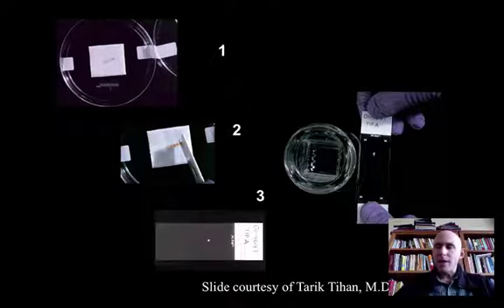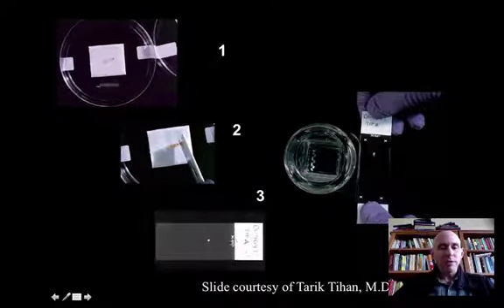You select the pieces that are not simply normal brain. In this example, it looks like a core of normal white matter. Probably is not going to be that abnormal microscopically. But in a core with a single core, you can take portions of each end, for instance, and place them on the slide, not too close to the frosted end, so that when you make the smear, you don't have material that's lost in that way. And then you immediately fix it in formalin, or in the ethanol-formalin mixture.